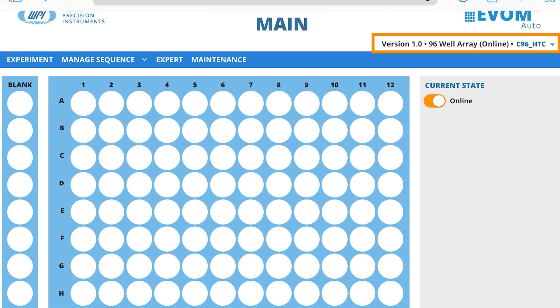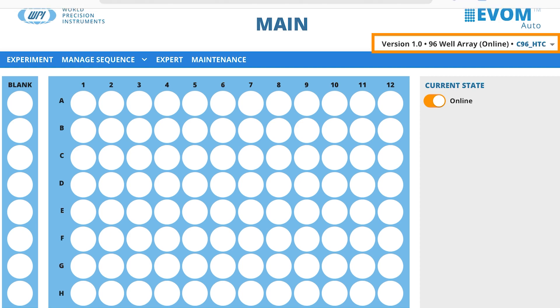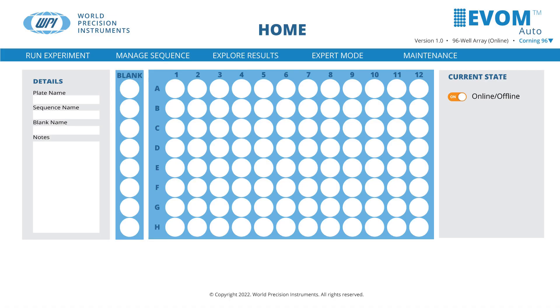Under the EVOM Auto logo, the system automatically displays the head type. This field is not editable.